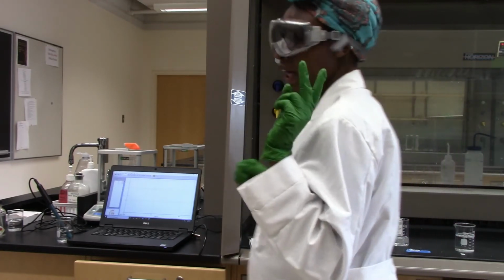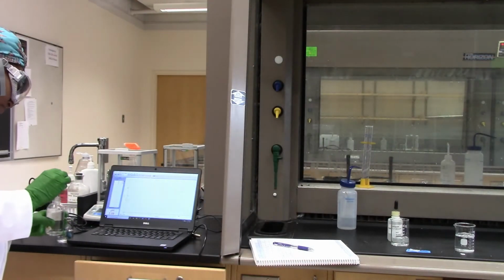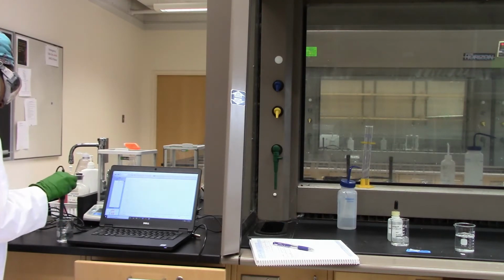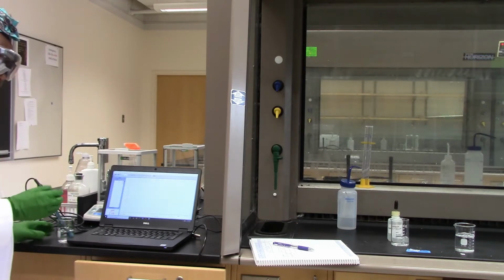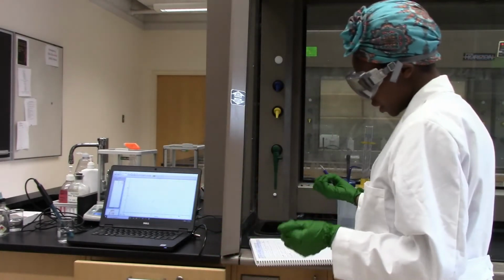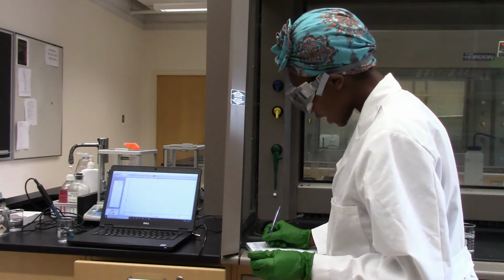Now I'm going to add 2 more drops of HCl. Well, this 1 molar HCl is really acidic, as you can see what it's doing. So the pH is dropping again to 2.19.